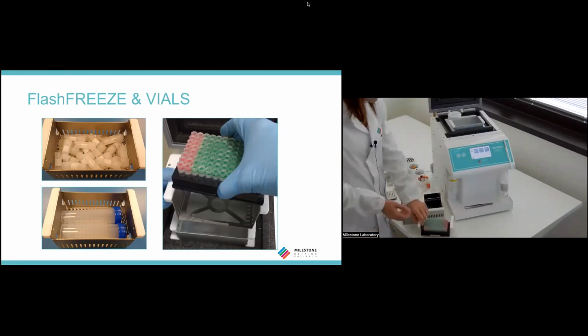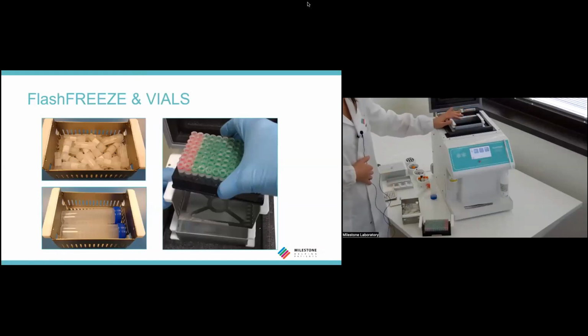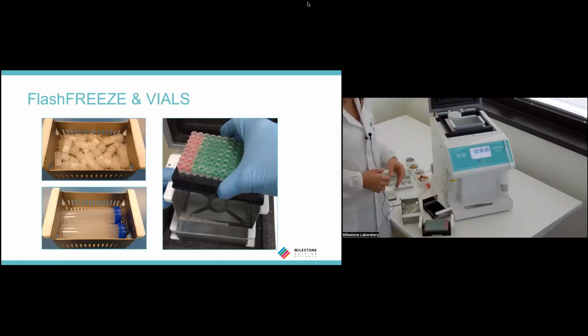Otherwise, it's possible to insert an empty plate in the freezing container, bring it to -80 degrees and add the samples as they are prepared for a snap freezing. When the plate is full, at the end of the working day, it can be transferred to the biobank.